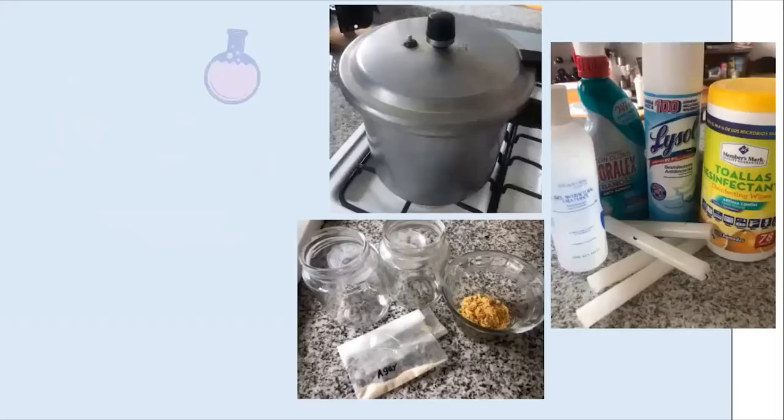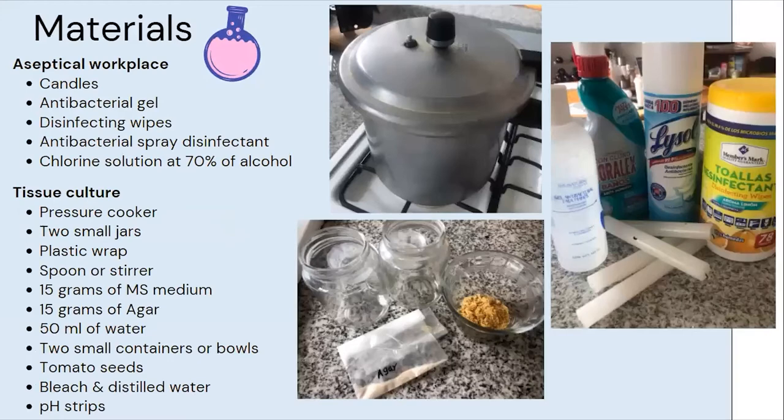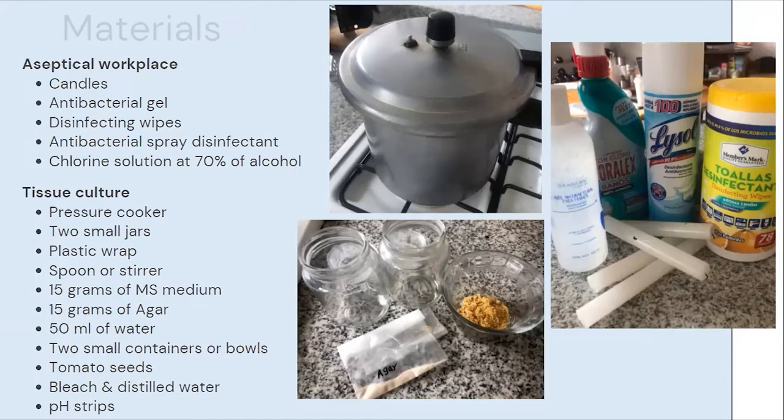The materials for the aseptic workplace are candles, antibacterial gel, disinfecting wipes, antibacterial spray disinfectant, and chlorine solution and 70% alcohol. For the tissue culture, you need a pressure cooker, 2 small jars, plastic wrap, a spoon or stirrer, 15 grams of MS medium, 15 grams of agar, 50 milliliters of water, 2 small containers or bowls to mix the medium and sterilize the seeds, tomato seeds, bleach and distilled water, and pH strips.